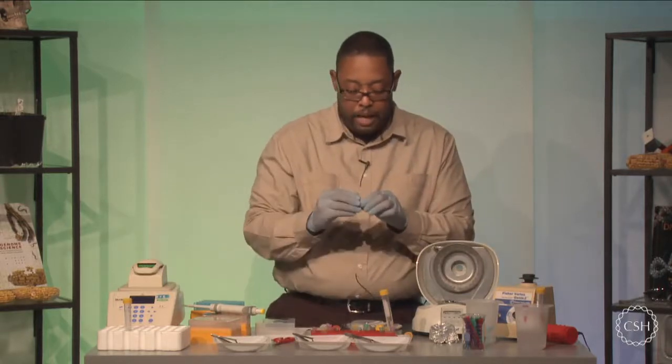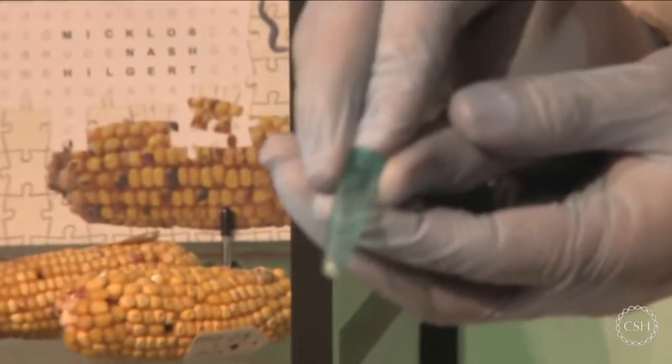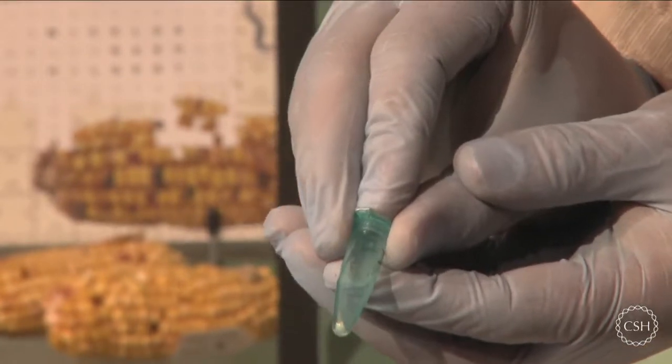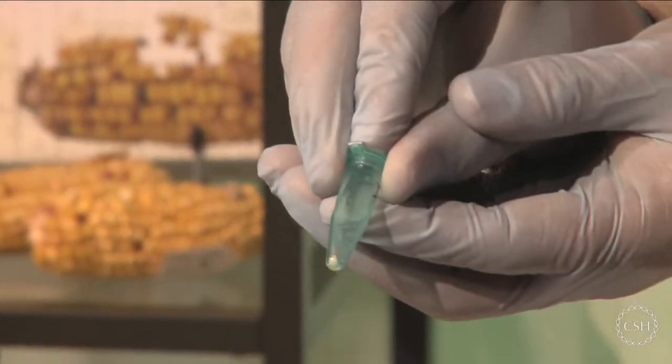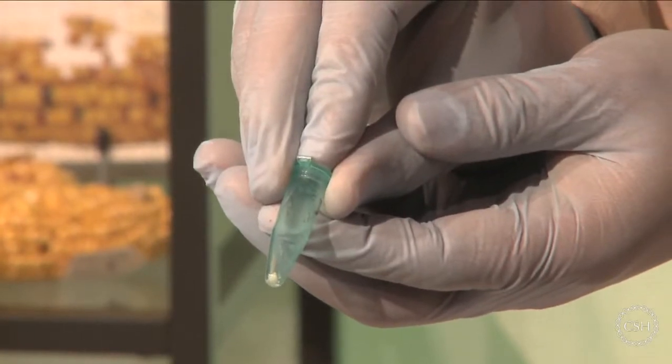Okay. Now, one thing, if you can actually zoom in on here, is that I have my test tube with my resin at the bottom, and you can see a really clear visible pellet at the bottom of the test tube. So this is something that's really nice about the silica resin, is that you're always going to have a pellet, and you know that on that pellet should be bound DNA, which is a nice feature.